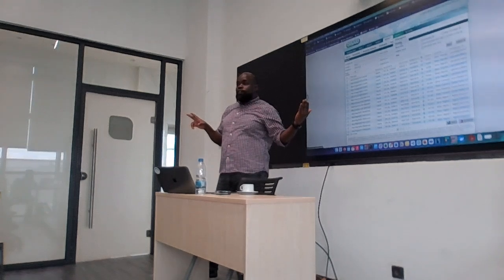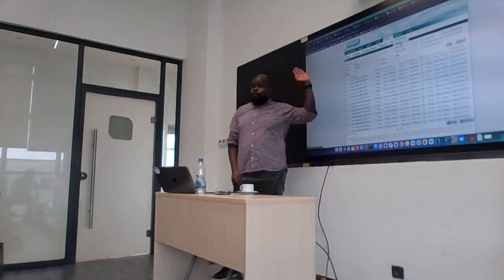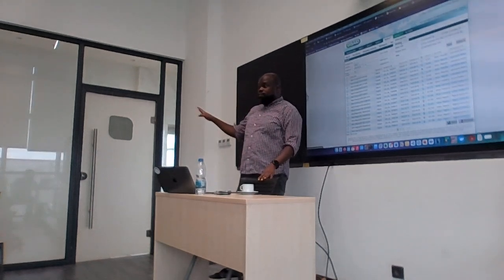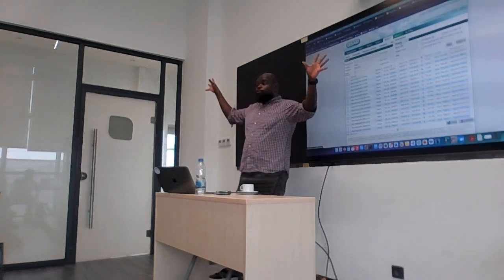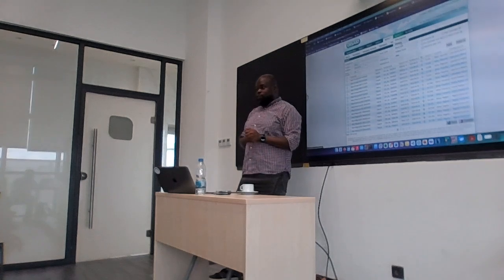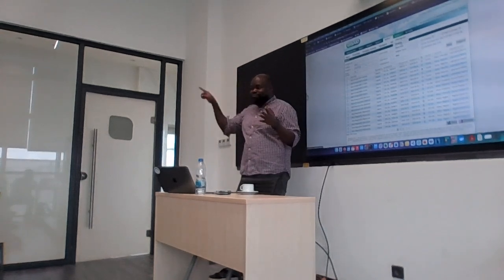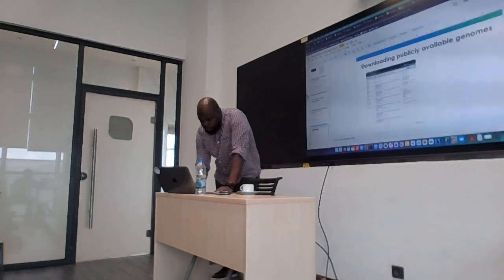Secondly, you're not sure if all the sequences that you have in GenBank are also here in GISAID. Because some people only submit to GenBank. They don't submit to GISAID, right? So sometimes, myself, I am forced to download both, combine them, then remove duplicates. So I just want you to understand this process, that now you're getting into the weeds of the bioinformatics. It's a long process, but I want you to understand that process, okay?